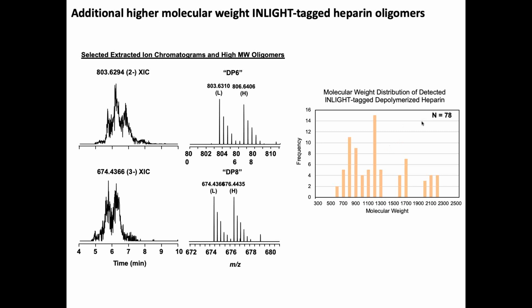If you go back to some of the rules with enzymes, then you can use those enzymes to your advantage. You can say, I have something which I think is important. It has a modification, but I'm not entirely sure where that modification is. But I can go to the New England Biolabs website and get an enzyme that could remove that important functional group with some level of structural specificity that could help inform where exactly it is. So I'm not sure what that enzyme might be.